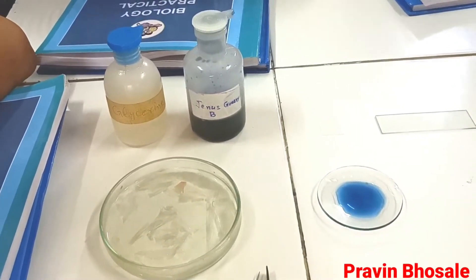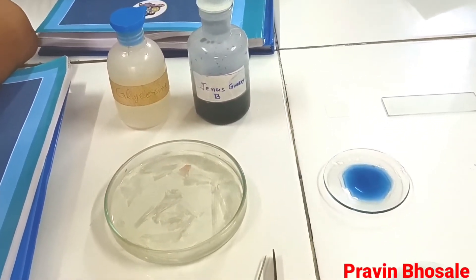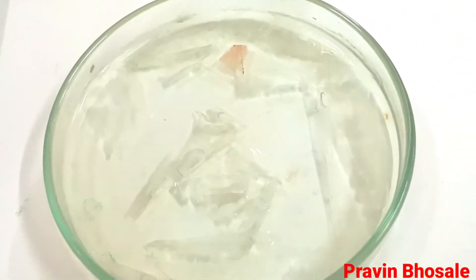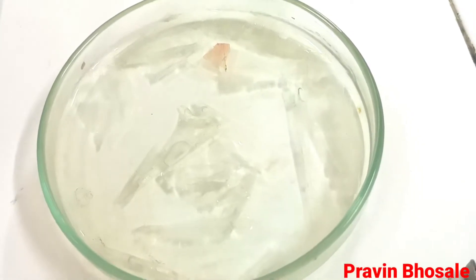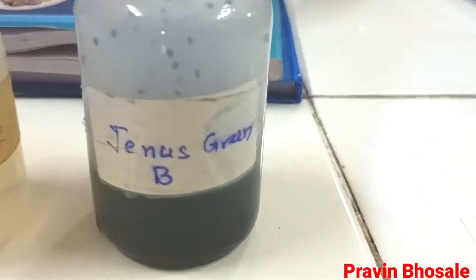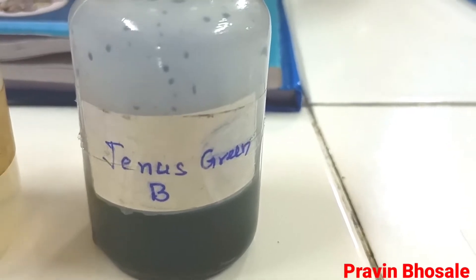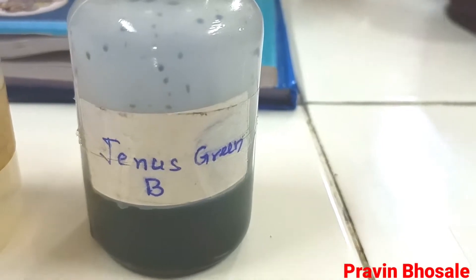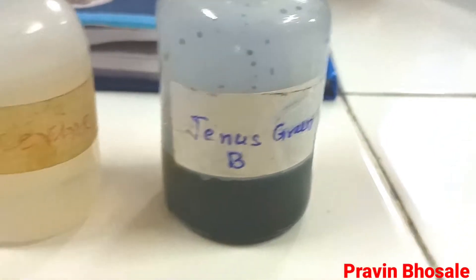Mounting of mitochondria. Let's see the requirements. First of all you require onion peels. Then we require Janus Green B — it's a staining medium that stains the mitochondria. So this is Janus Green B for staining mitochondria.